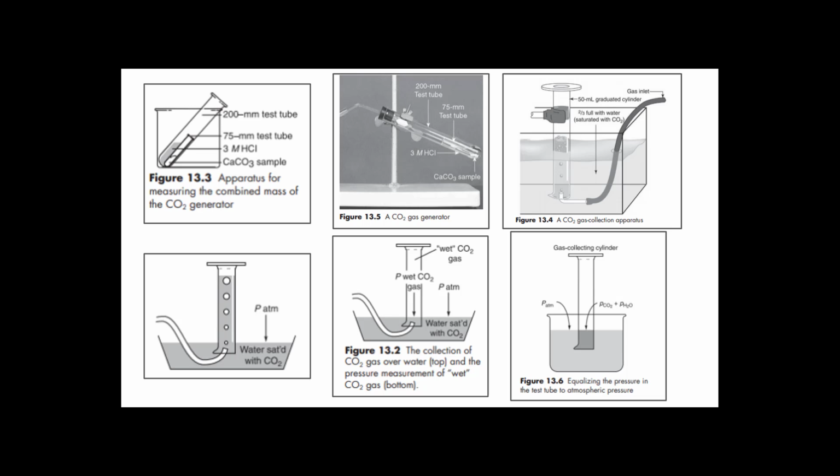That's the hard part. Everybody can flip this over with water, and it'll probably end up here. But to get this to flip, filled with water, and leave it at the top with no volume of gas is the hardest part. So that's what this takes. Students get pretty skilled at it after a while. So then you have it placed in water, and it just has to be two-thirds. The volume of the water in this one does not matter.